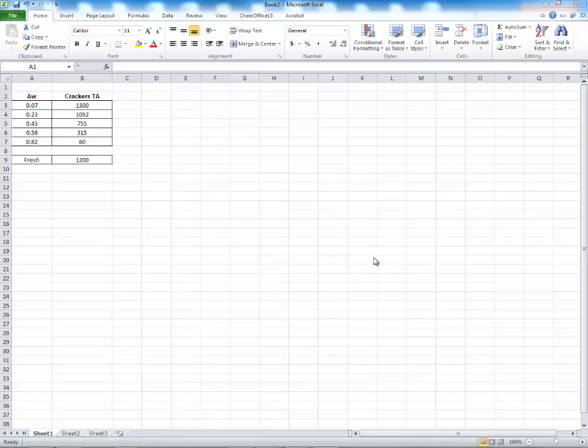Okay, this is a little video about how to handle the data that you might have collected in the physical properties lab or other labs in using Excel and graphing it. Here you have some made up data for the crackers. The texture analyzer data for the crackers, these values are in grams. And here's the water activities. And note I've split the fresh number out from the rest of the table.